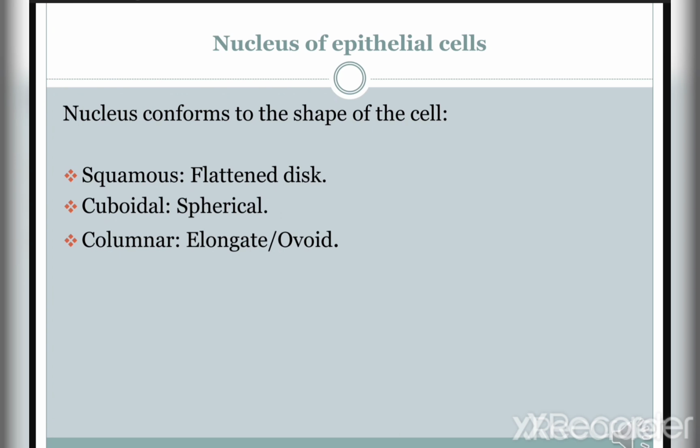Depending on the microscope magnification or resolution, most of the time you cannot decide the outline of the cell. These cells are tightly adherent to each other and the walls have interdigitation between them. So you cannot decide whether this cell is columnar or cuboidal.